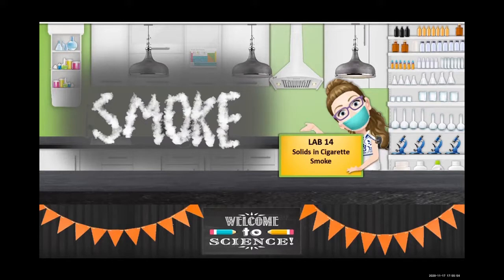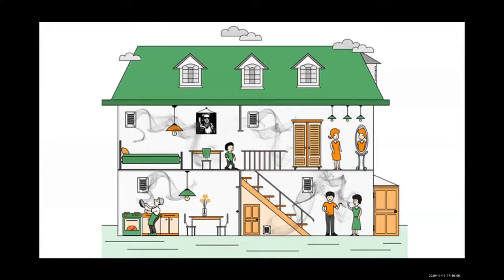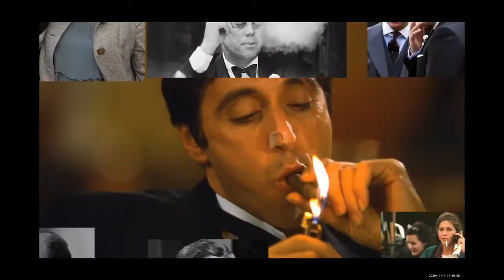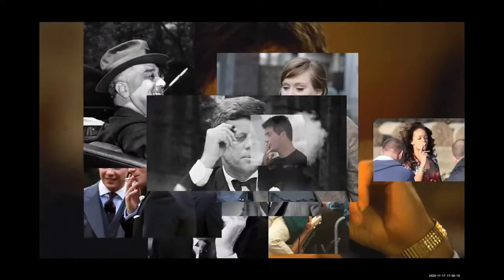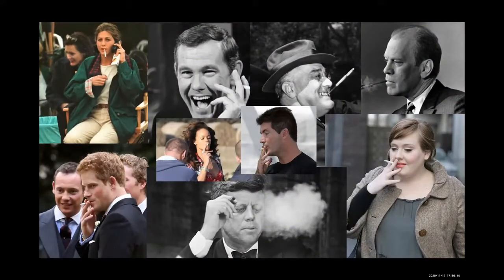Lab 14, solids in cigarette smoke. One of the most important contributors to indoor air pollution is cigarette smoke. Cigarette smoking is a widespread habit in our society, and it is likely that the social, political, aesthetic, and medical issues resulting from cigarette smoking have affected smokers and non-smokers alike.